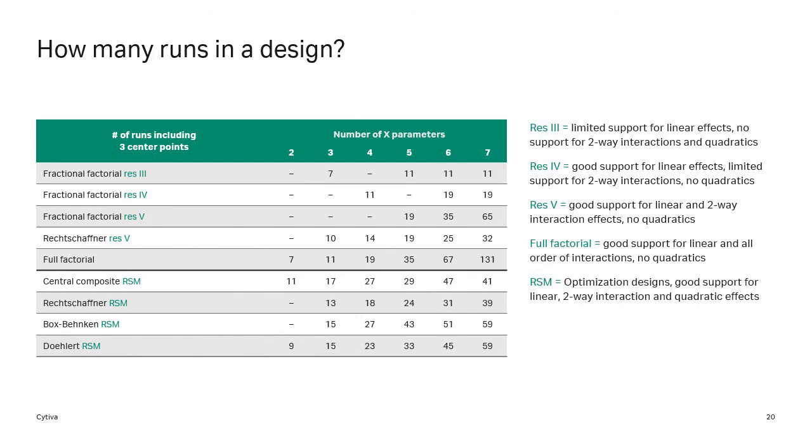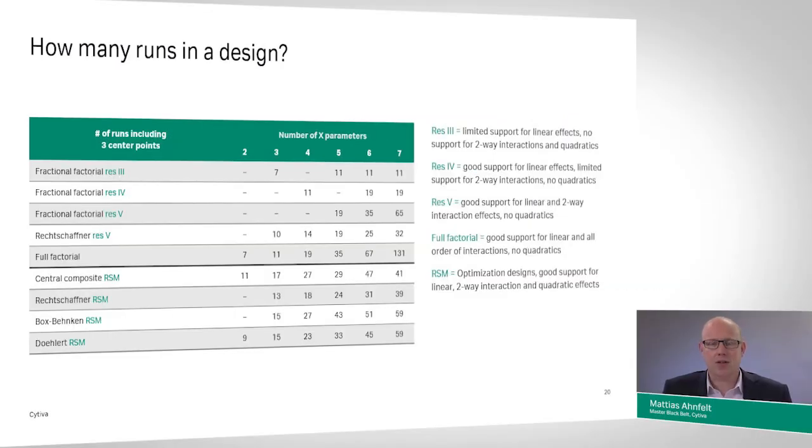And of course this table goes on. You could say that if we perform a 16-run fractional factorial, we could study as much as 15 process inputs. So it is very useful for screening a large number of parameters or robustness testing a large number of parameters.